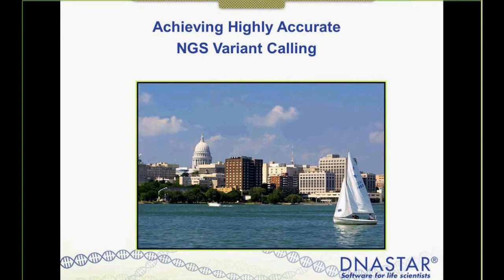And so we'll spend some time discussing how that's done, different points in the process where you lose accuracy and how you can assess where you've lost that accuracy. We provide nice visualizations so you can go and look at those places in an assembly, run the appropriate reports, and then kind of the final piece of that is a calculated accuracy at the end, and that's literally assessed by determining how many variants you can detect in a known sample, right?